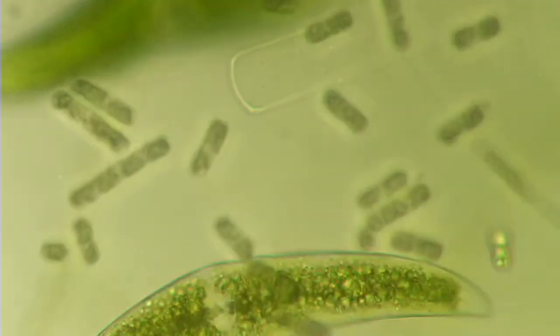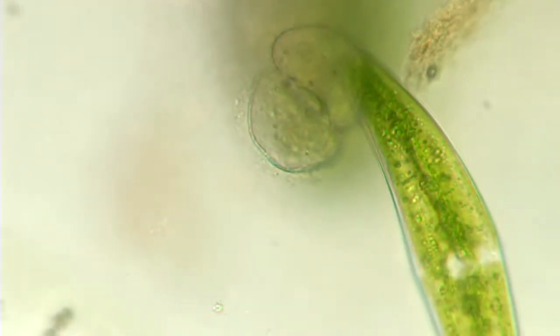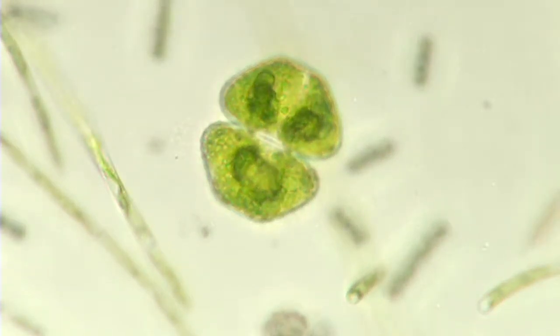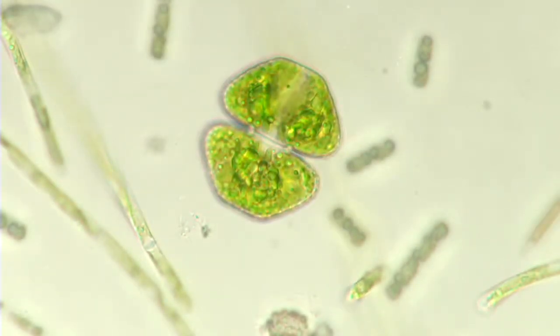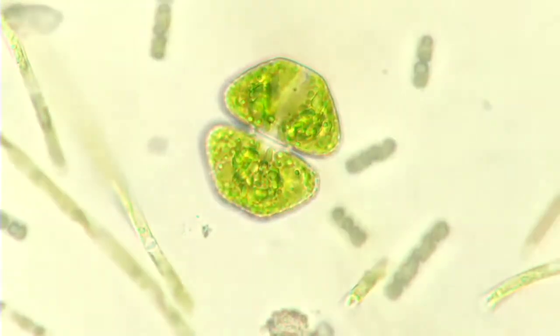You know why that's blurry? All these freaking filaments — I love it. Get out of this, I'll go somewhere else. There's a nice Cosmerium. Here we go.